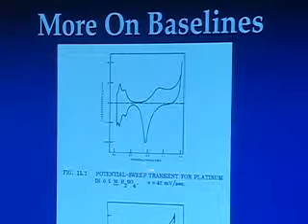In addition, this is just intrinsic to the system, but sometimes you have some impurity in your solvent or in your supporting electrolyte or whatnot, and it gives you a redox active species that you don't intend to be there. And again, you might interpret that as the interesting species if you don't have this baseline. The baseline can be a little tricky.